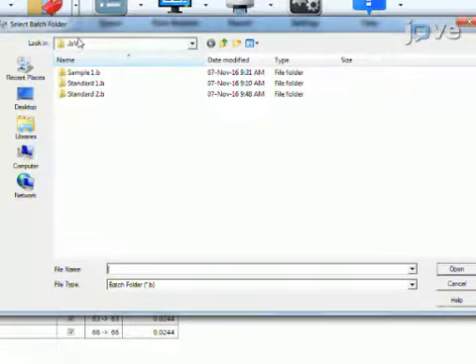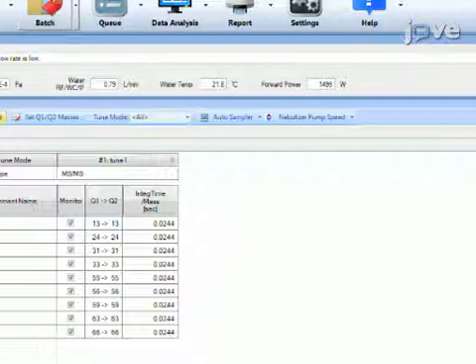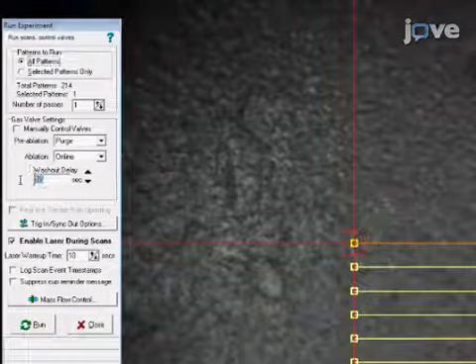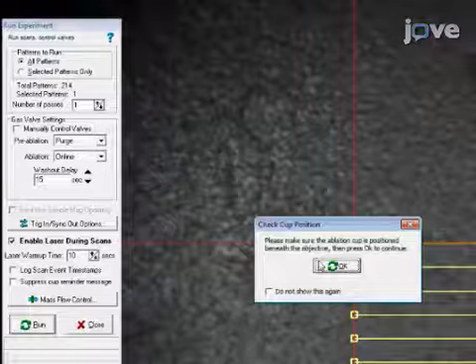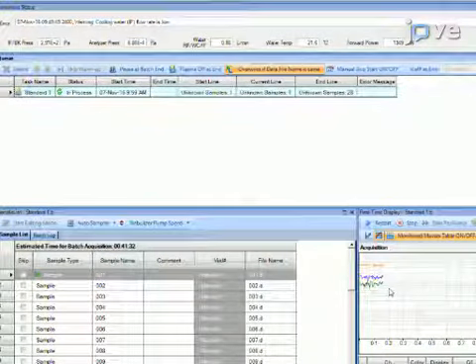Once the ICP-MS has warmed up, add the first batch to the queue and ensure that the software is waiting for a trigger from the LA instrument. Then, in the LA software, turn on the laser power supply and set the laser warm-up and washout times. Start the laser sequence and check that the ICP-MS correctly starts data collection after ablation.